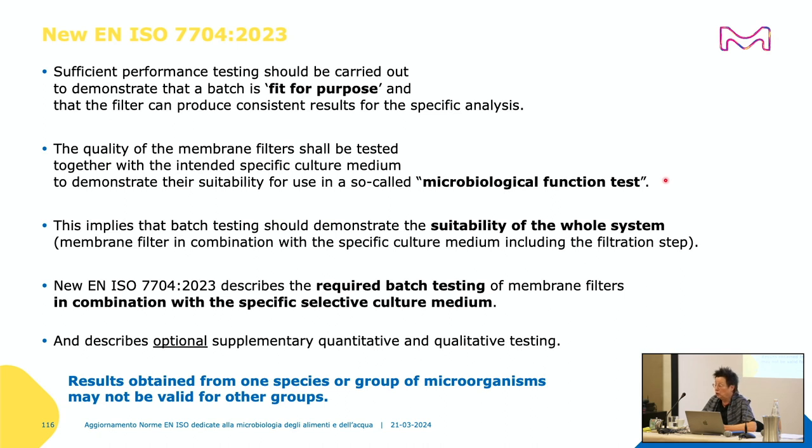It is very important to show that the whole system is suitable for the test, because we had data in ISO that some combinations were not detecting any Legionella, where Legionella were definitely in the sample. We were not able to find the scientific reason for this. We had some assumptions, but at the end, ISO cannot do this R&D work to find out why. But ISO has to do the work to describe a good analysis to show that this combination is fit for purpose. So that was the reason that EN ISO 7704 now describes the batch testing of the membrane filters always in combination with a specific selective culture medium.